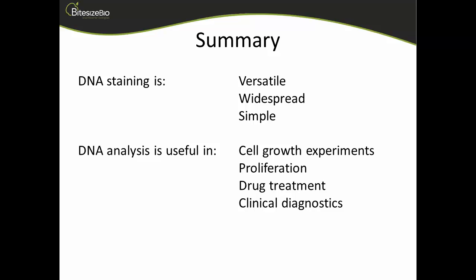right of your screen. Derek, the first question we have is there a minimum number of lasers needed for a flow cytometer to be able to perform DNA analysis? Well, you're only ever going to use one, really, for your DNA dye. So as long as you have the right laser for the dye you want to do, yes. Most of the early work that was done on cell cycle analysis was using propidium iodide because it was very widely available. And 20, 25 years ago, most cytometers only had a blue laser. So you only need one. And just a dye that will be excited off that one, I guess.